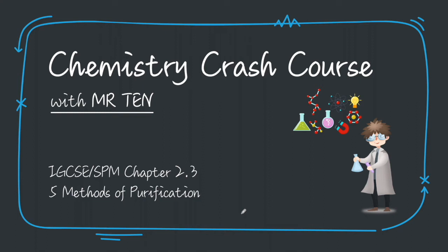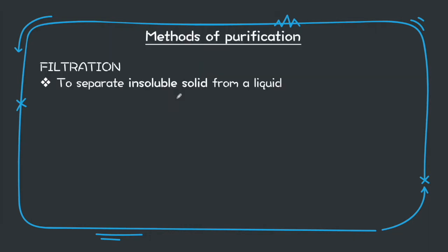Hello everyone, this week we are going to move on to the main points of this chapter, focusing on the 5 methods to do purification. The first method here is filtration. Take note, it is to separate insoluble solid from a liquid.